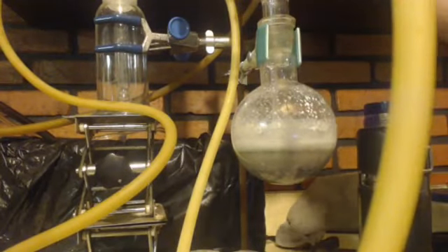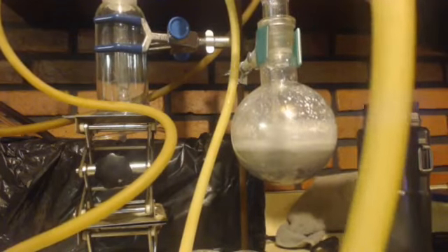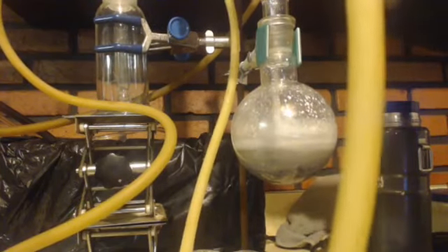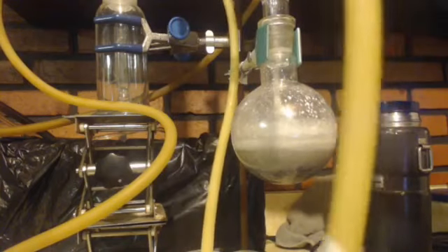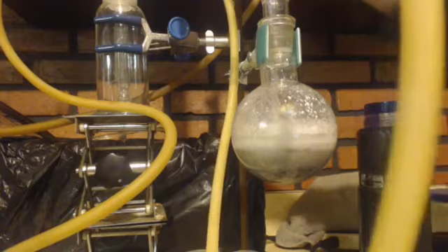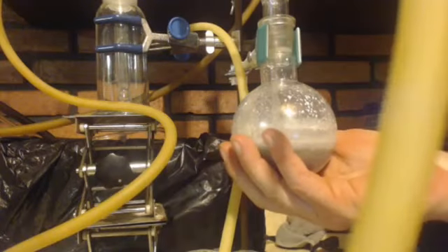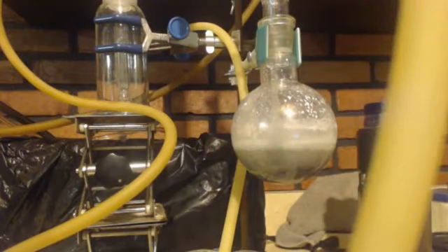Nothing's bubbling through anymore, so I'm going to take this. Whoa, did you hear that? I'm going to take this and put it like this. I don't want it to get any suck back. You can see there's stuff in there. Now we're going to have to quench it.